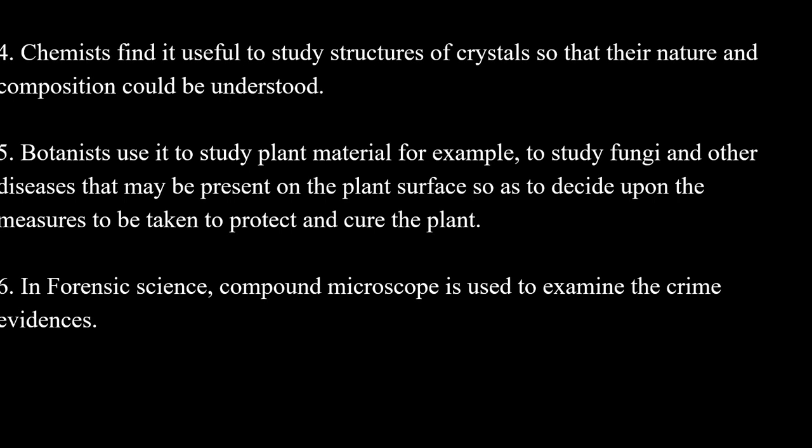Chemists find it useful to study structures of crystals so that their nature and composition could be understood. Botanists use it to study plant material, for example, to study fungi and other diseases that may be present on the plant surface so as to decide upon the measures to be taken to protect and cure the particular plant. In forensic science, the compound microscope is used to examine crime evidence or the microscopic structures which are present at the scene of the crime.